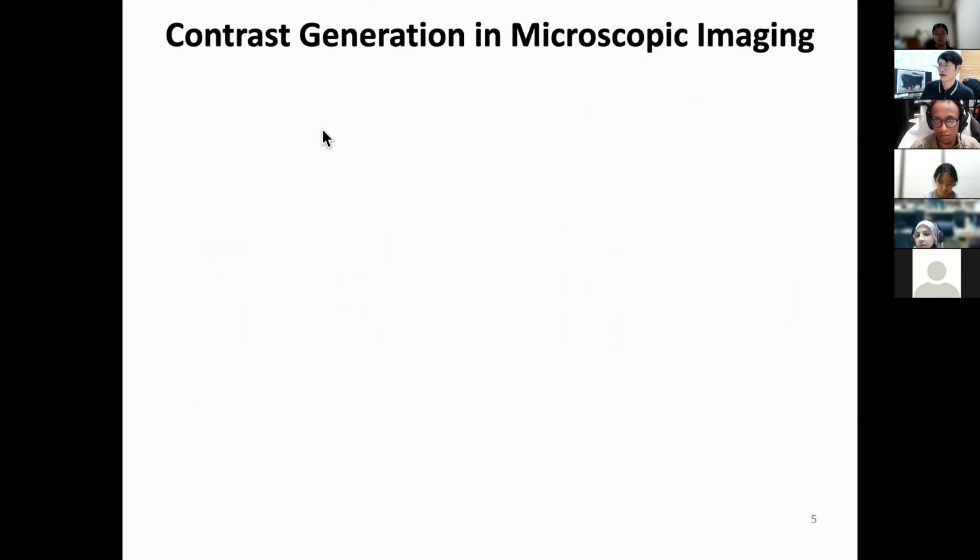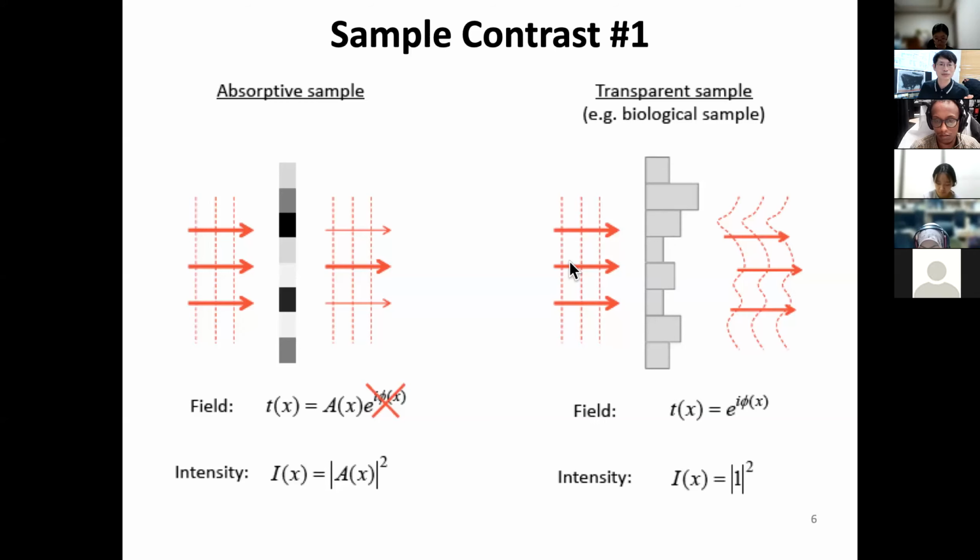So in that case, you can consider, hey, I have a cell culture layer. How can you describe it? You send a plane wave, and through this you see the arrow itself remains the same, which means there's no change in the amplitude of the light, while the wavefront is distorted.